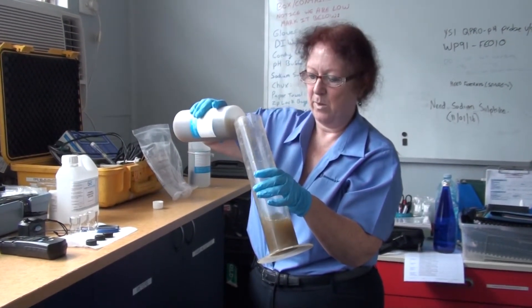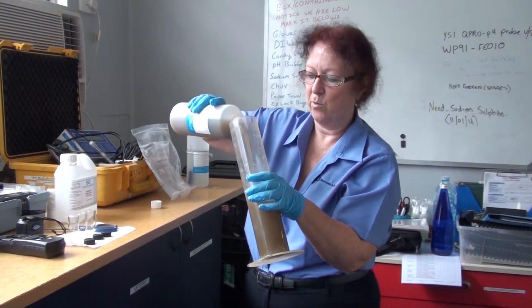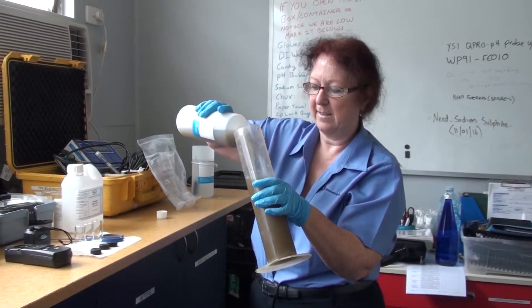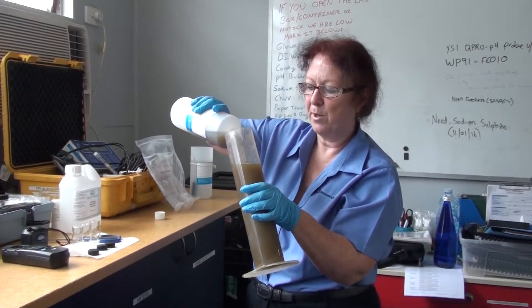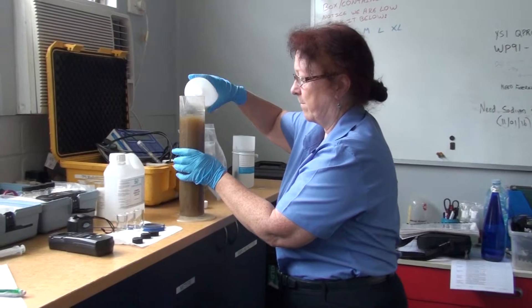We want to make sure that we get it pretty well dead set level with that 1000ml mark. So I'm just tipping it down the side until I get within cooee of it, and then I'm going to pop it on the bench and just fill in that last little bit this way.